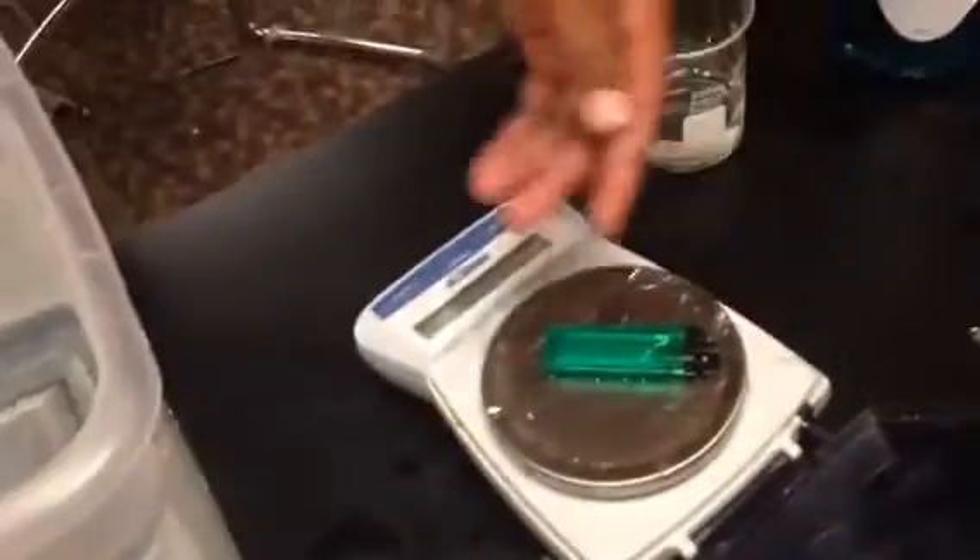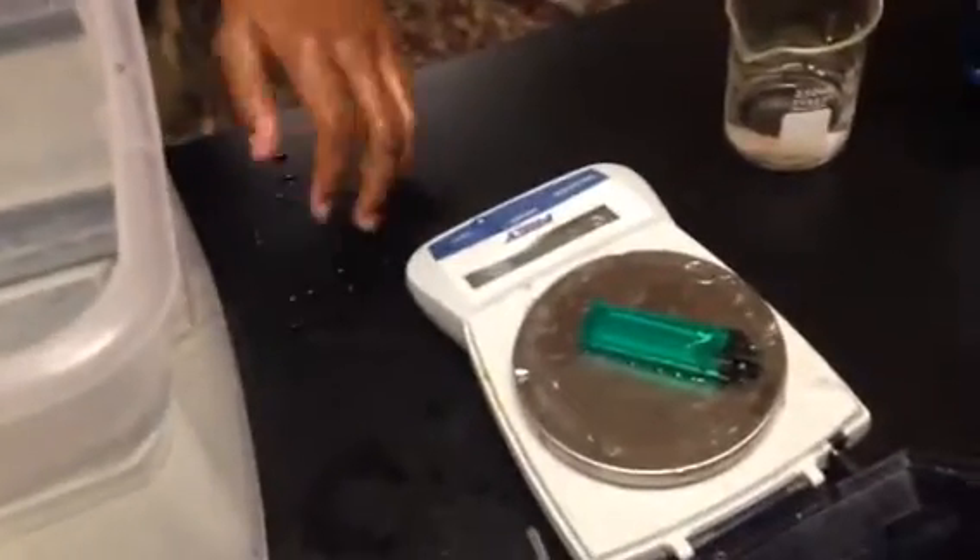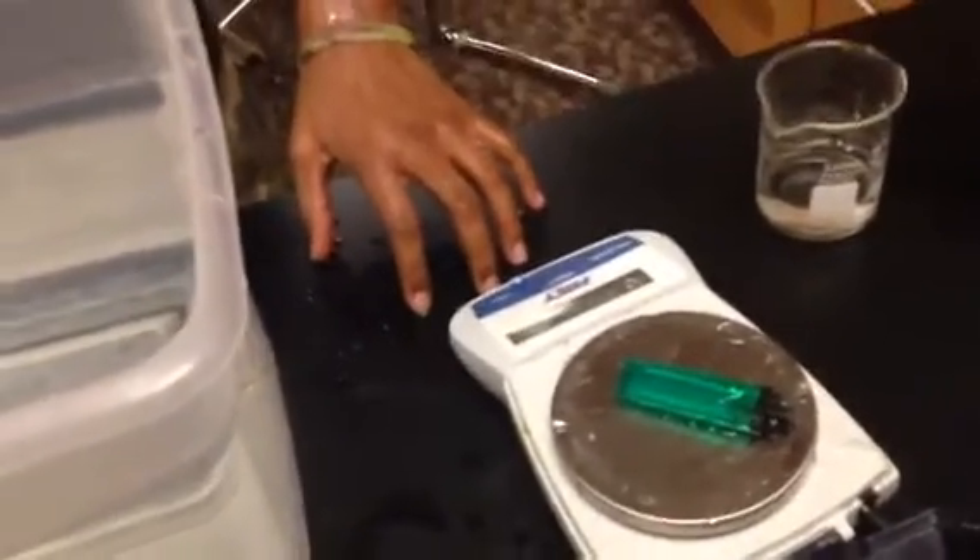Now we need to put the lighter back on the scale. We'll get our final mass of the lighter. The difference between the two is the mass of gas that's in the graduated cylinder. And you all should know how to calculate mass to moles so that we can plug it into the equation.